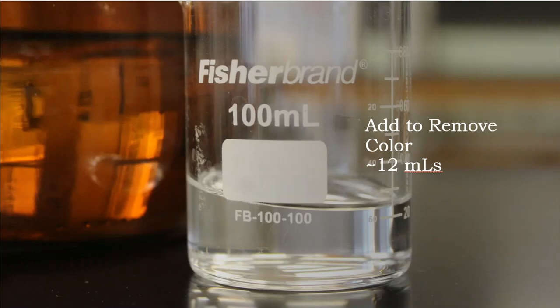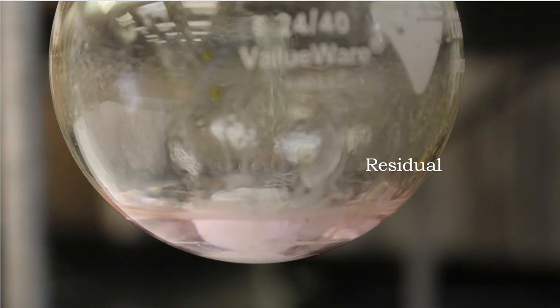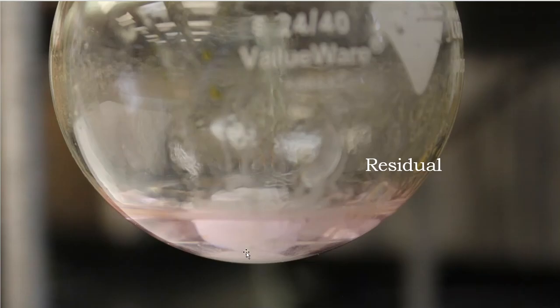I'm going to take a little bit of that hexane and transfer it over to a beaker just so I can easily pour it out. They only want me to use about 12 milliliters, and that's about what I used. So I'm going to pour about 12 milliliters into the boiling flask. And if you look at my boiling flask, folks, look at this tinged solution down here at the very bottom. This means that there was stuff left over, and hexanes has just been added in, and hexane is going to grab that material and transfer it up and out into the separatory funnel, which is where I need it to be. This is all product right here that I'm going to lose if I do not do that.